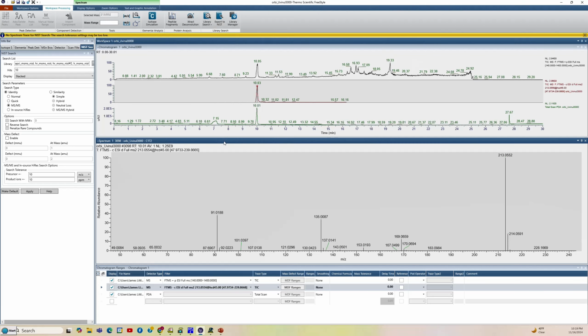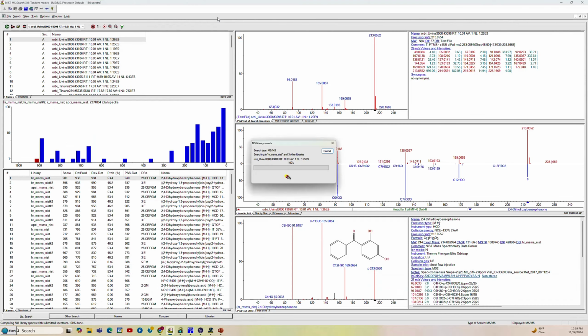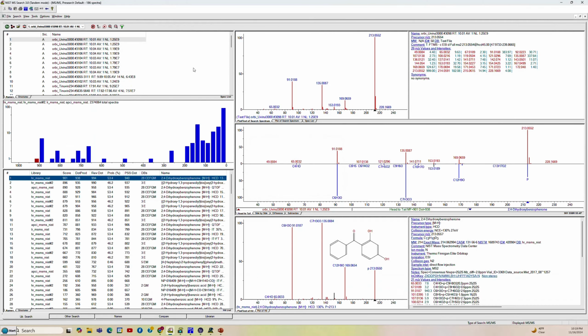If you don't select the bar, it doesn't bring these icons into focus. So export to NIST, and it brought it in and searched it. If you go into the NIST search, we need to save some parameters here to make sure they're correct. They're already saved for me, but I'll walk through a couple of them.